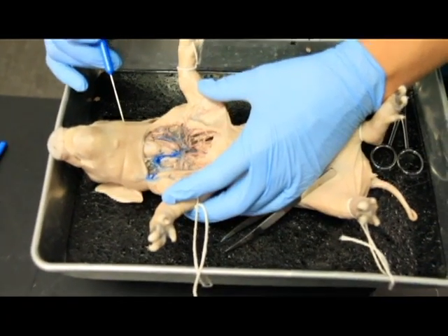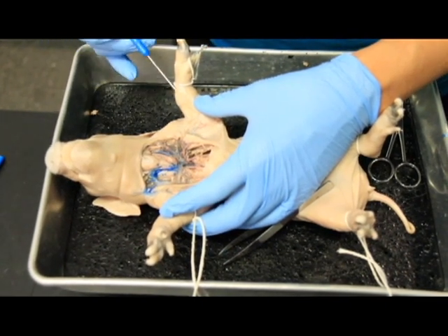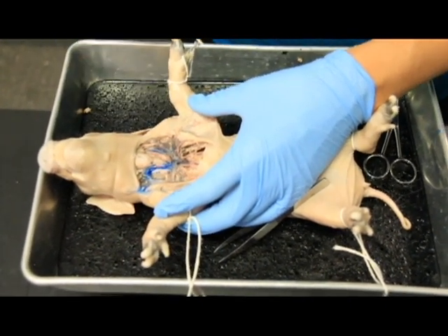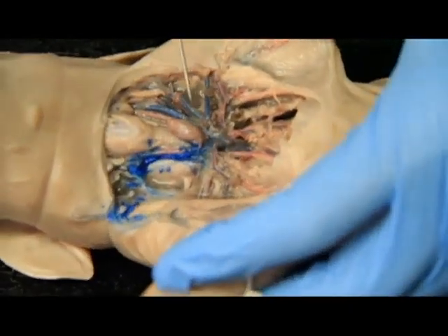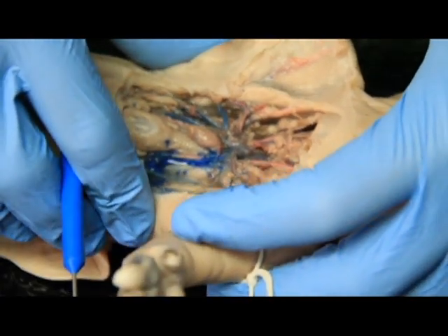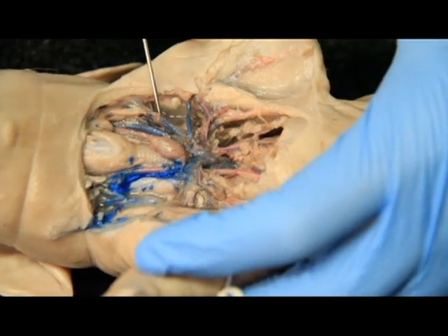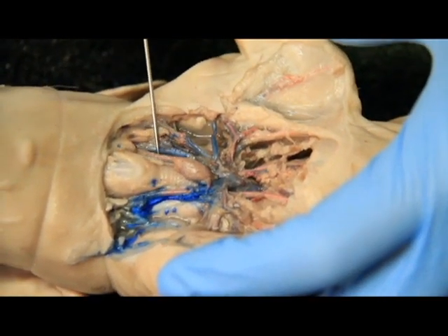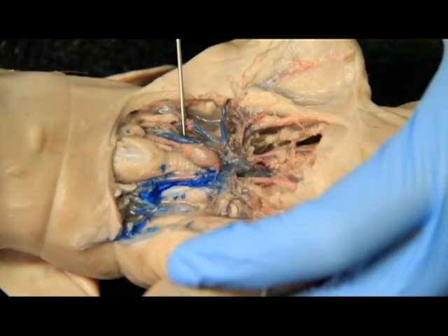Okay, so the circulatory system is very hard to dissect without cutting away these veins and arteries. So what I wanted to show you guys was those counts that I gave you based on the diagram. So you can see jugular 1 here, jugular 2 here. Both sides, again, I've splayed the pig open, so if he was sitting naturally, these would be much closer together. And so this is a jugular and this is a jugular. This red one right here, this is going to be your carotid artery and your jugular veins.